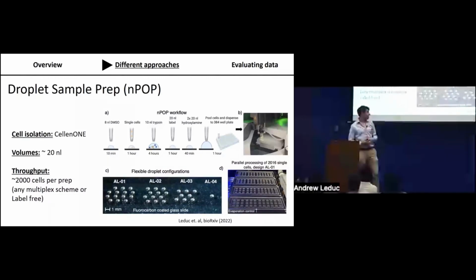There are only so many hours in the day, and there are lots of things to explore along these lines. But to the extent that you can use orthogonal approaches to prepare your cells for dispensing, and randomize the order in which you run your samples, this is the way you're best able to attribute these different sources of variance. If you understand the sources of variance well, and your samples are randomized, you should computationally be able to remove most of these sources of variance.